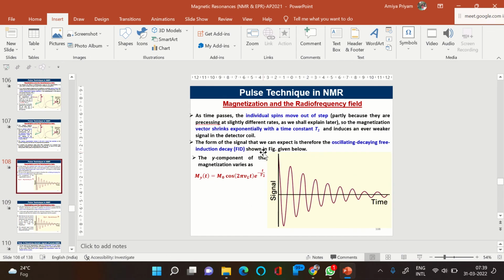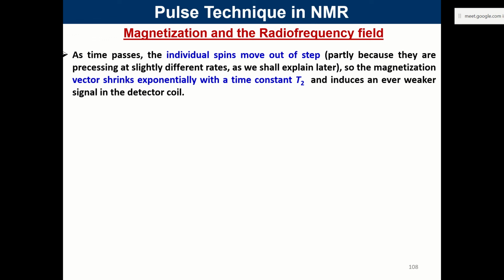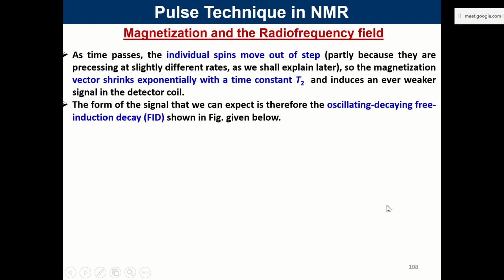Let me just rub it off to convey the idea. So oscillating, decaying, free induction.